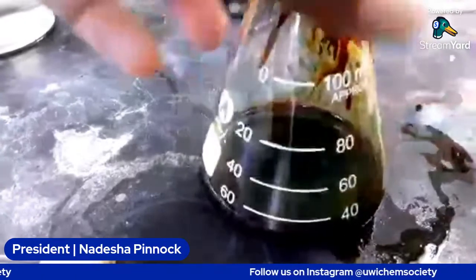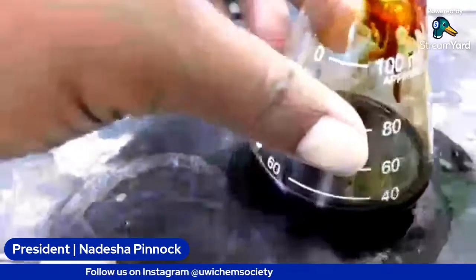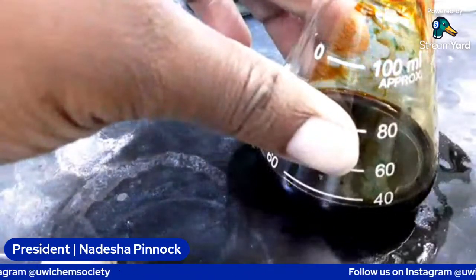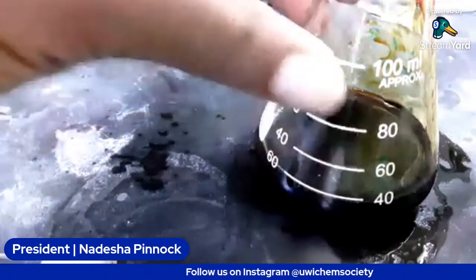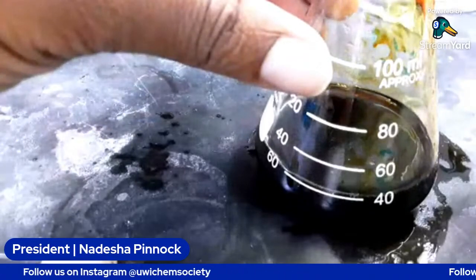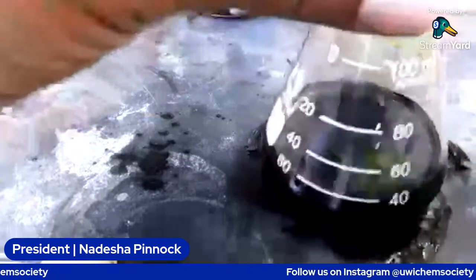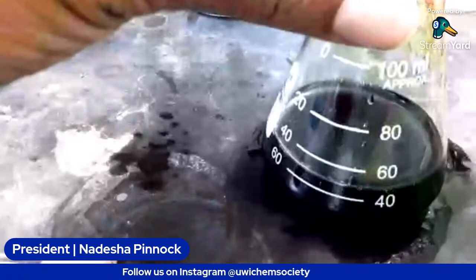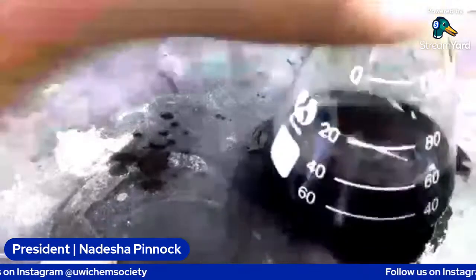So we're just going to get it in between that mark to get 50 mils. That looks like it's between.